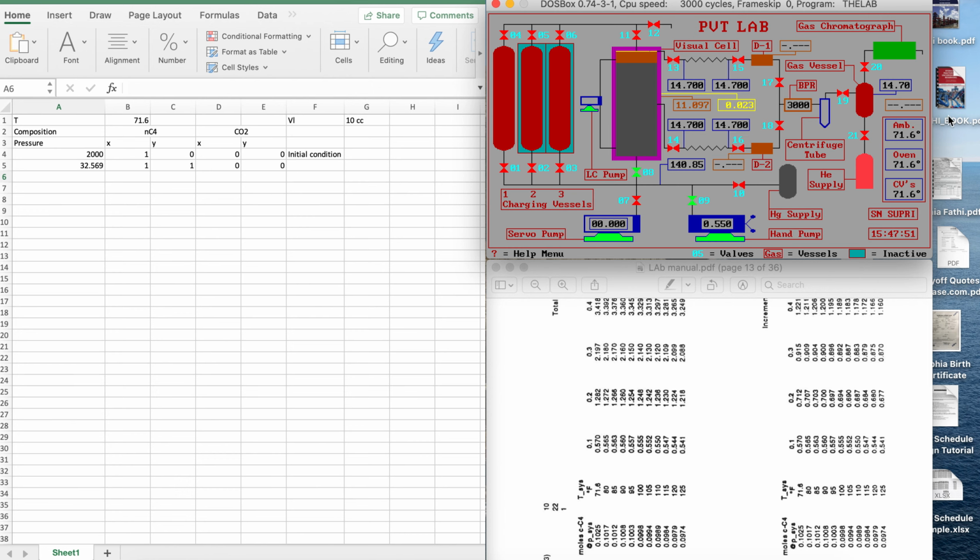So I have 0.02. So I'm going to inject 0.02. So I look at the amount of gas and I inject something very close to that. And then I'm going to shake the cell. Okay. So we got to the point that we have 0.002 cc's of gas. And if you remember, we said 0.001 or 0.002 is considered to be the first gas bubble. So now I know this is my bubble point pressure. So I have bubble point pressure as 140.9.